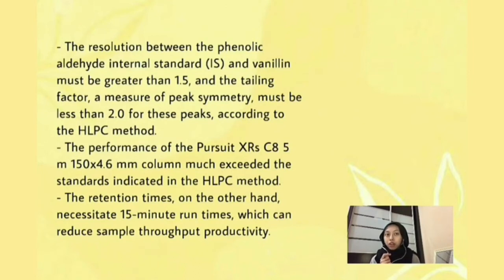The performance of the Pursuit XRS C8 5 micrometer, 150 times 4.6 millimeter column greatly exceeded the standards indicated in the HPLC method. And the last one, the retention times, on the other hand, necessitate 15 minute run times, which can reduce sample throughput and productivity.